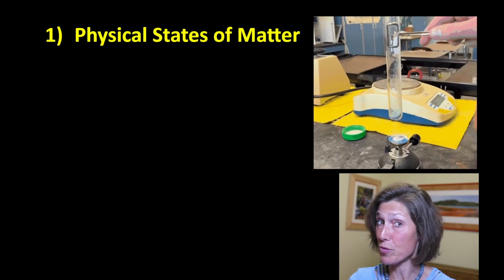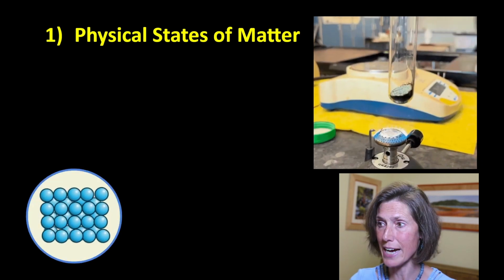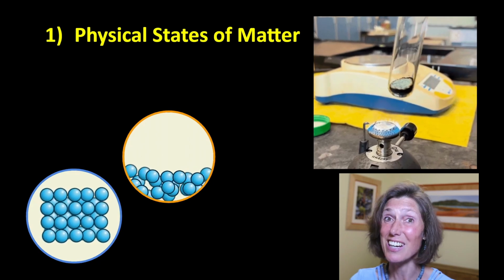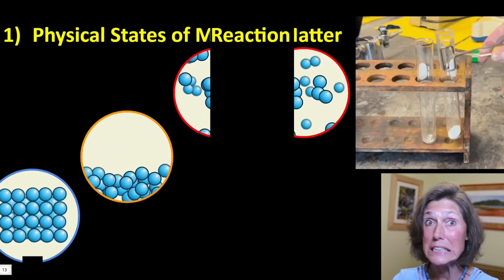All right, so physical states of matter. What are we dealing with right here? Clearly, we're starting off with a solid reactant. I don't see much of a liquid happening, and I know that there is a gas formed, but can we see that gas right now?